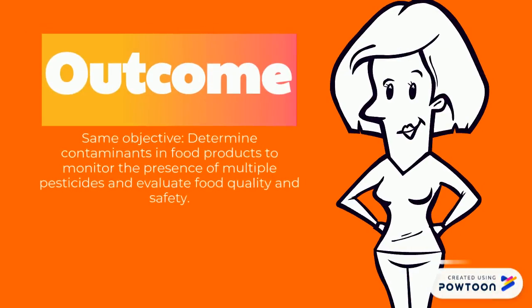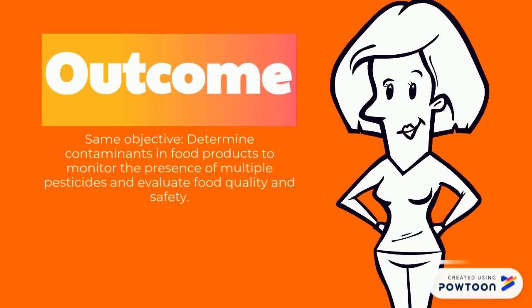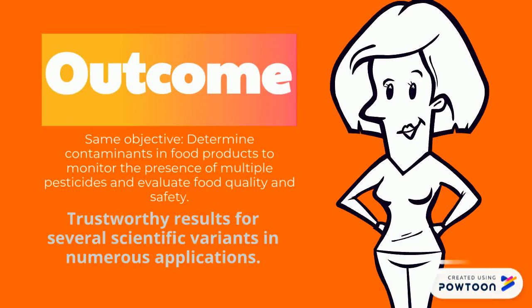To conclude with these examples, all of them pursue the same objective of evaluating the quality of food or beverage products. This technique is a widely used option for this type of analysis and a number of applications, where trustworthy results are obtained, giving importance to several scientific variants.